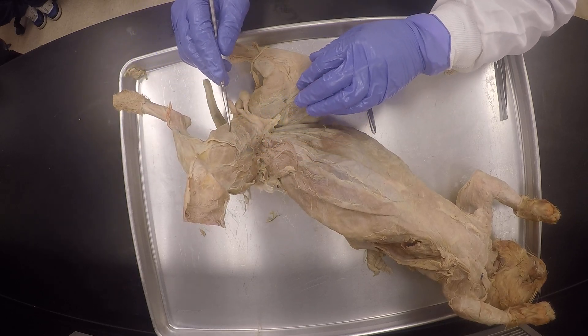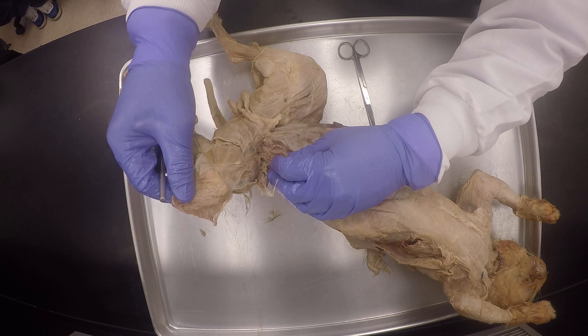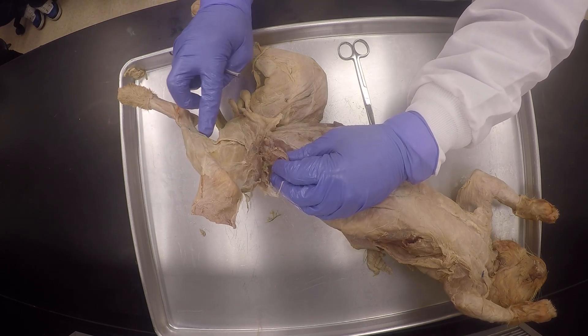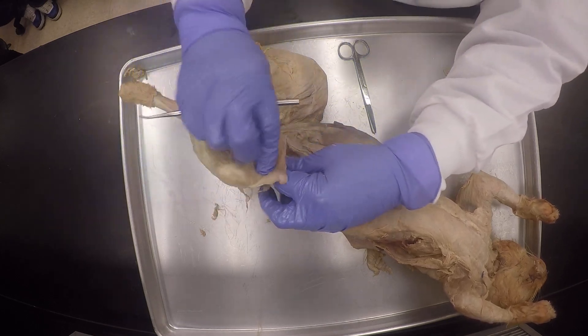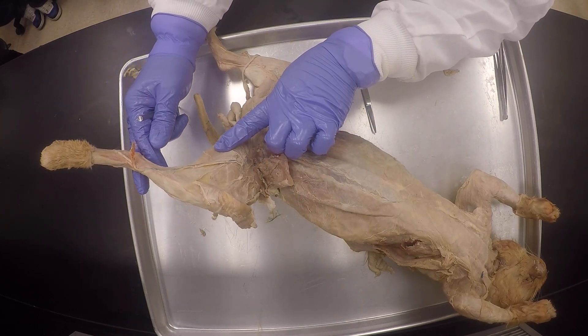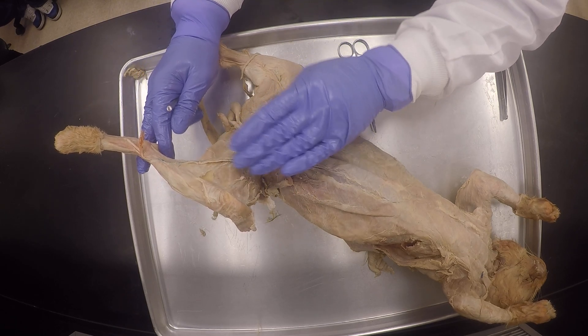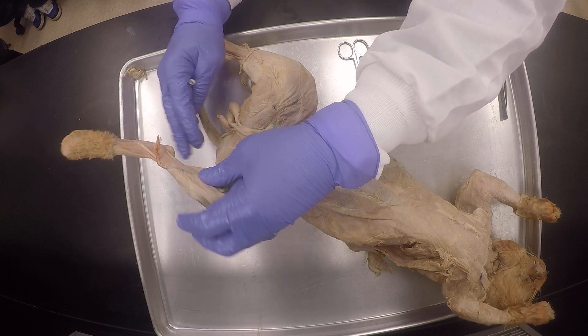So this one, the gracilis, is like the sartorius in the front, but I'm not going to cut it. I used to do that, but then it used to fall off. So what I'm going to do is just peel it off completely like this and flip it. I'm not going to cut it like I did the sartorius. Once I peel this off, I'm going to reveal some of the adductor muscles here too, and then towards the back of the thigh it will be the hamstrings.